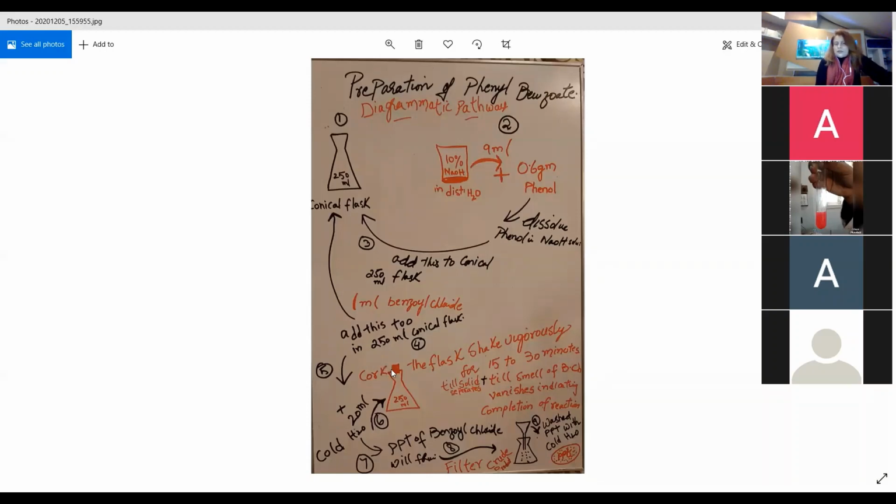Cork the flask. Now, there's particular glassware that they are using here. This consists of a conical flask, a volumetric flask, beakers, measuring cylinders, and then, of course, a cork also. Do you know what a cork is? Cork lagate hain bottle ke upar, we have to cork the bottle. These are brown colored corks, I don't know if you have seen them in the lab or not, but you have to cork it with something.